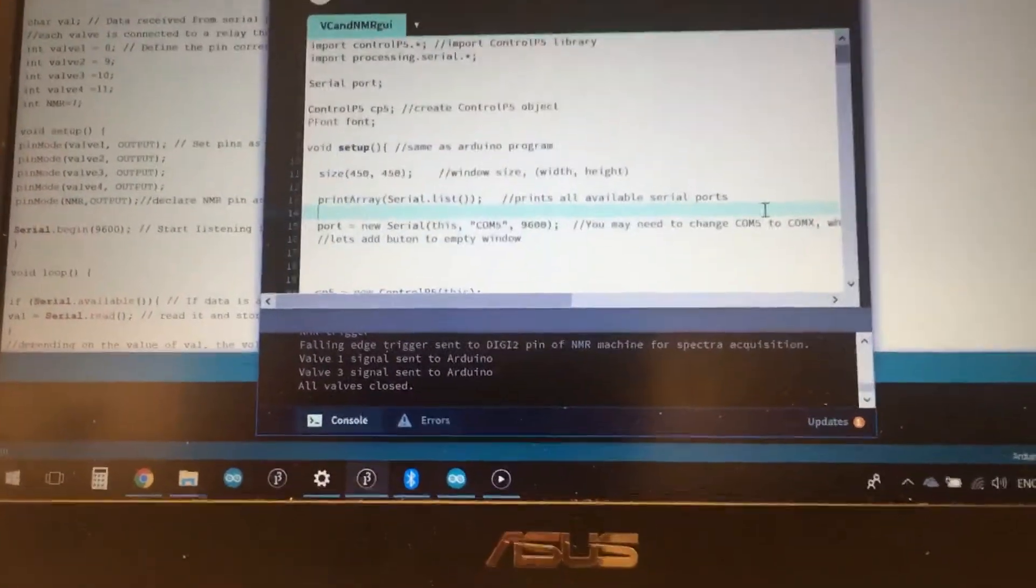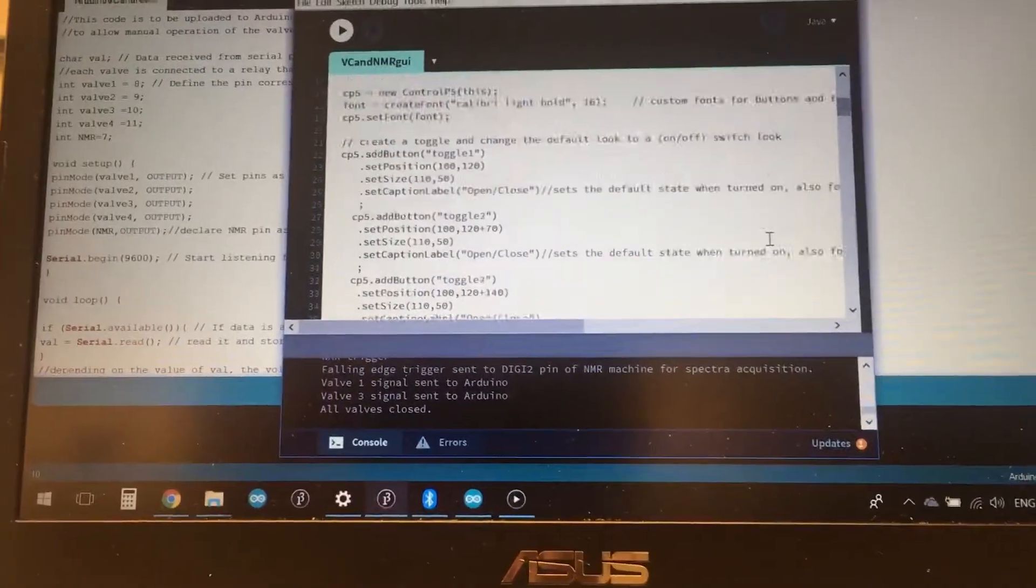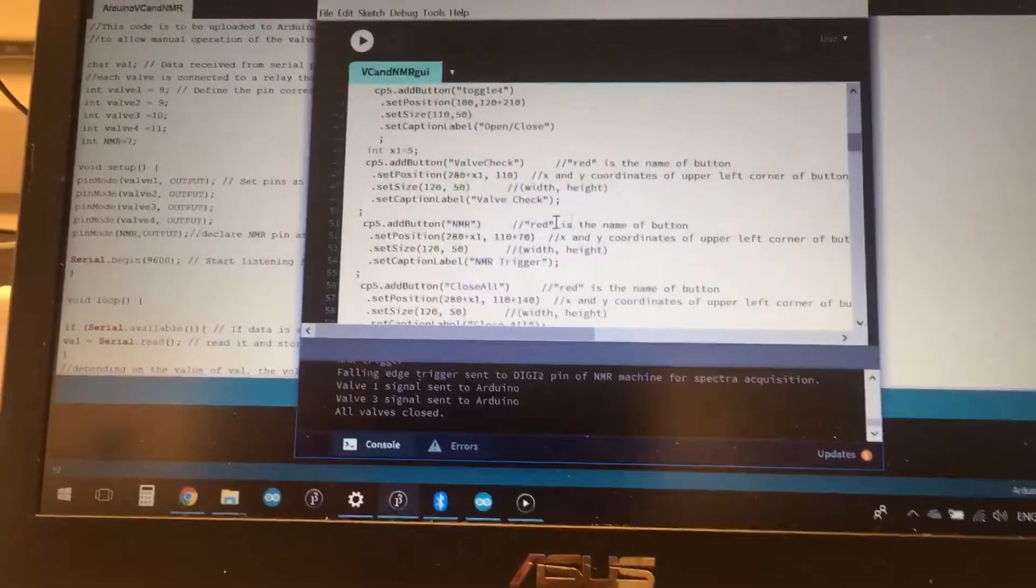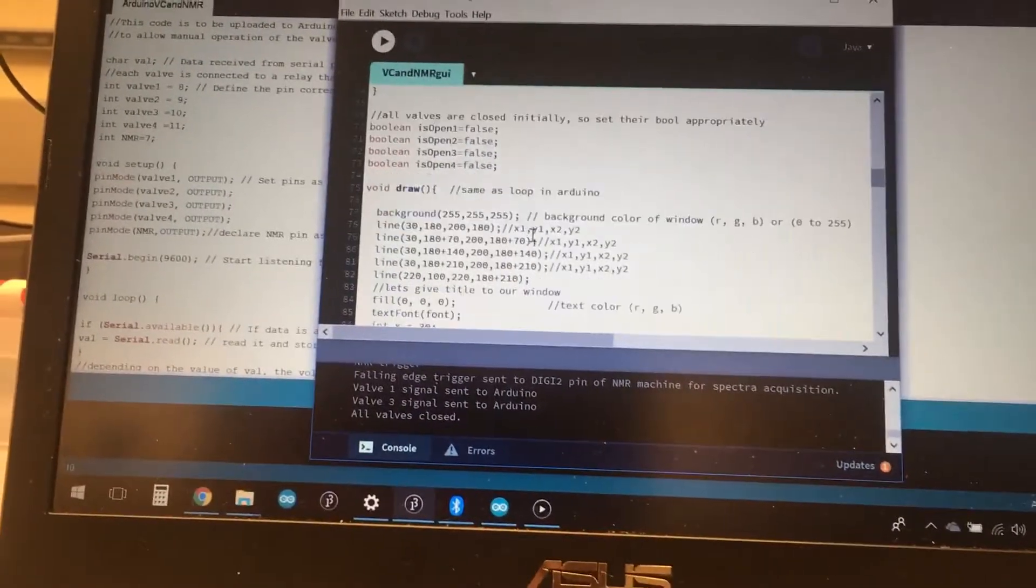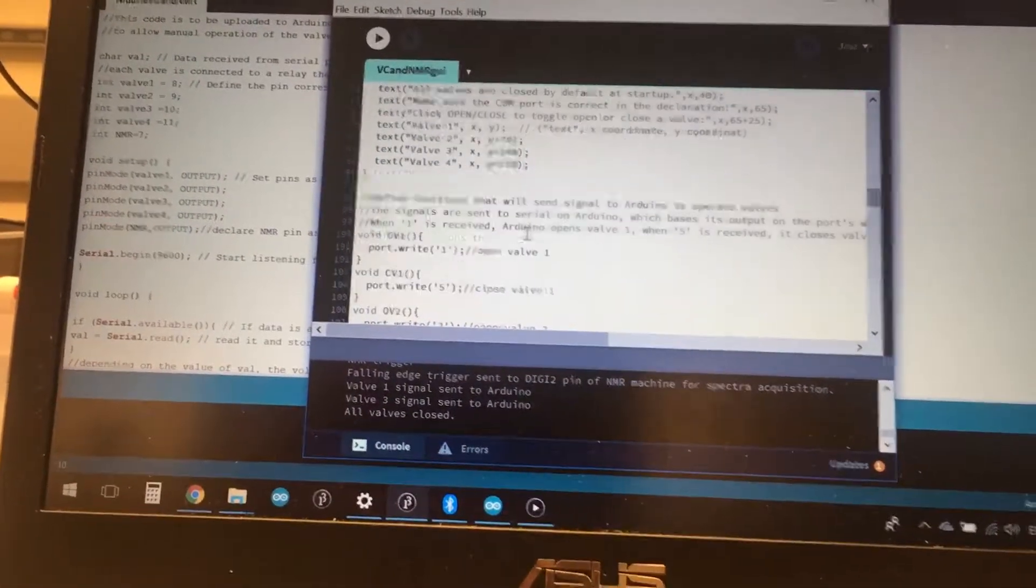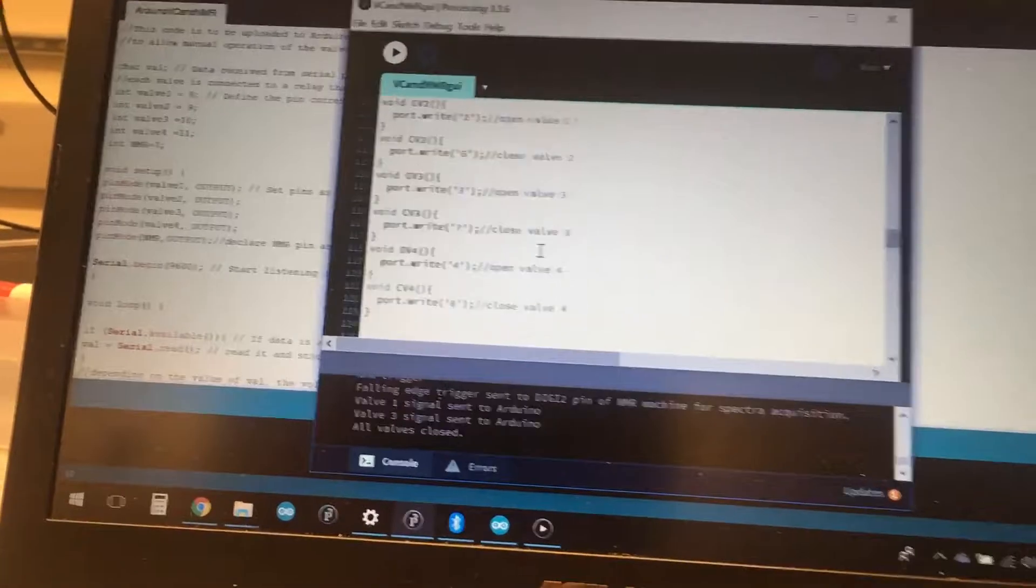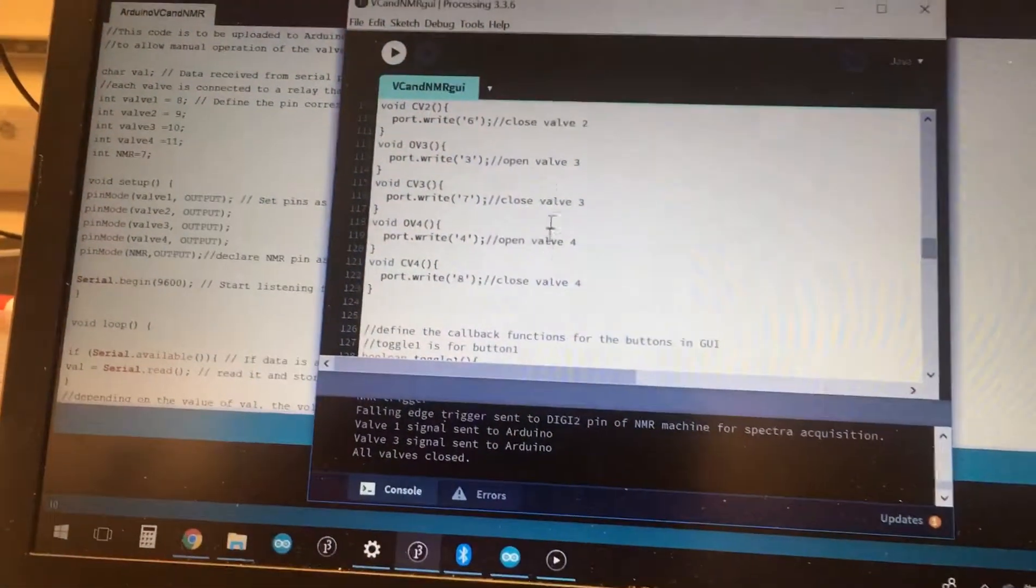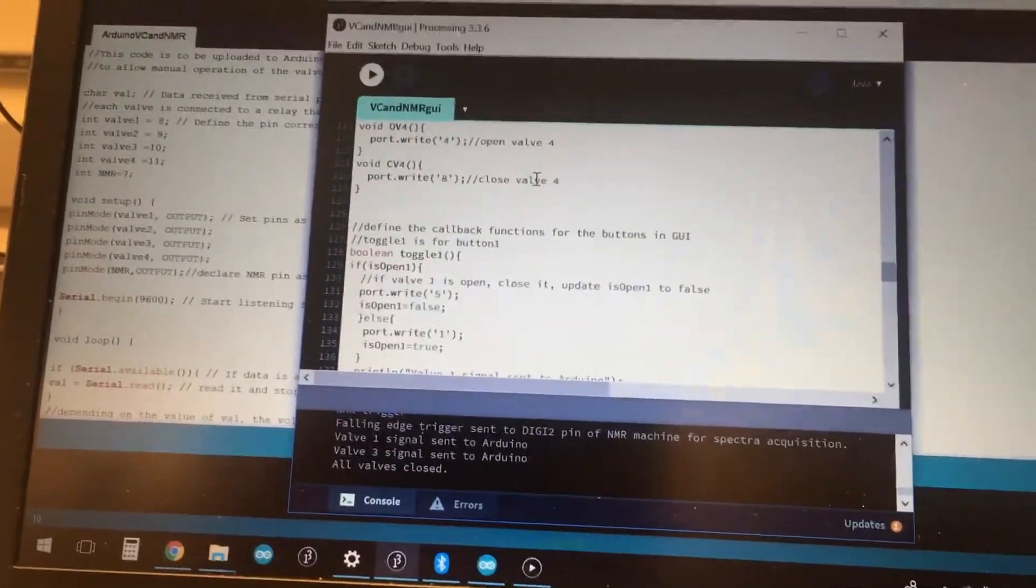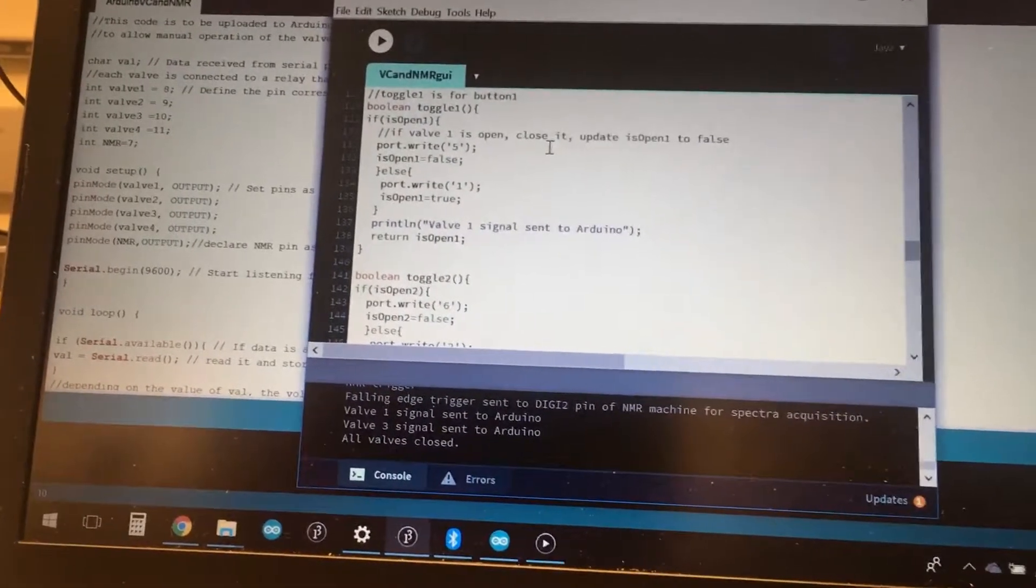Just to go into the code a little bit more, what you can see is every button is first declared, and then we have a callback for that button. When the callback is received, it sends something over the serial port, which in this case is this Bluetooth module, to the Arduino itself to actually do something, and so that's how we're actually controlling this stuff.